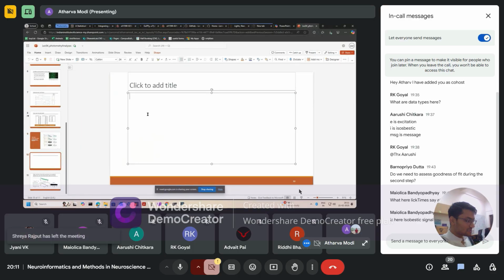Yeah. So basically, if this is your fluorescence signal, Fe, and the other is Fi, Fi is your control signal. This is your excitation signal, which is the signal of relevance. Now what you do is find an estimate of Fe, an estimate for excitation, using a simple linear regression.